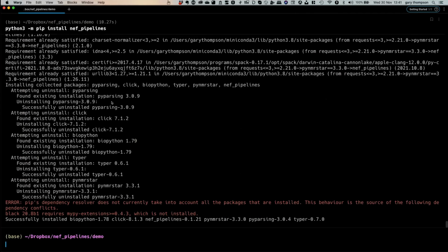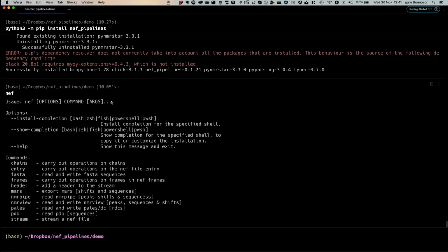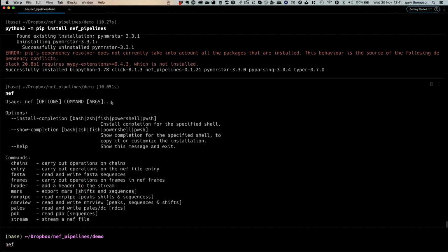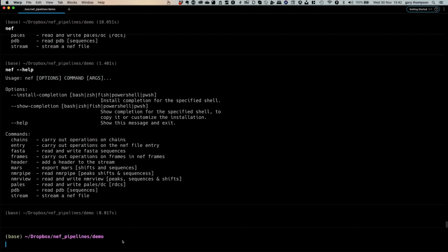So we should perhaps add that in order to install this, we've now put on the update server, as part of Analysis, a script which will allow you to install it. Aha, I'm back in working order again. So this is showing that if you type NEF without input that it understands, it will show the help screen. We can also do --help as well.